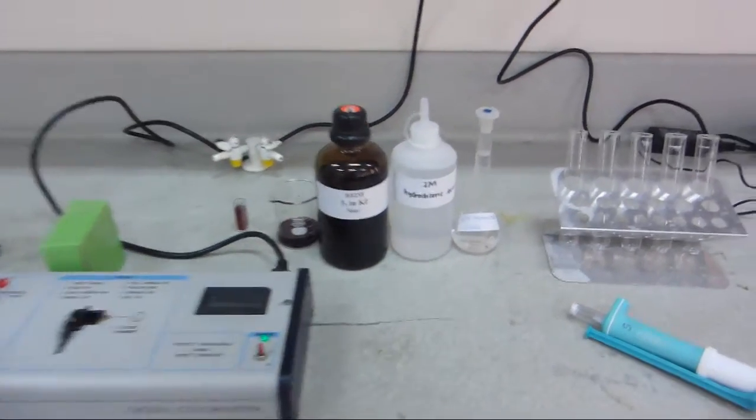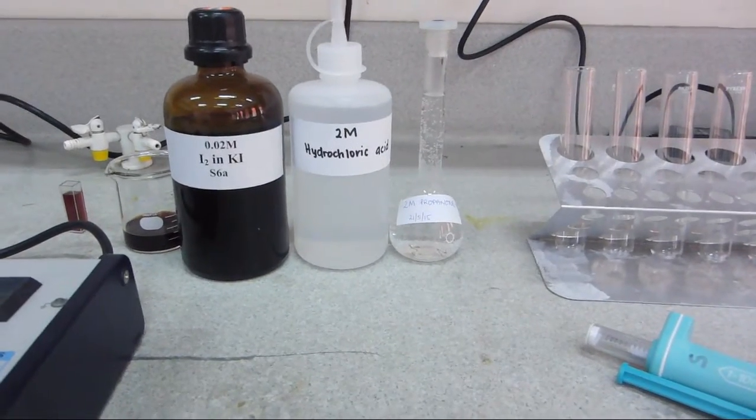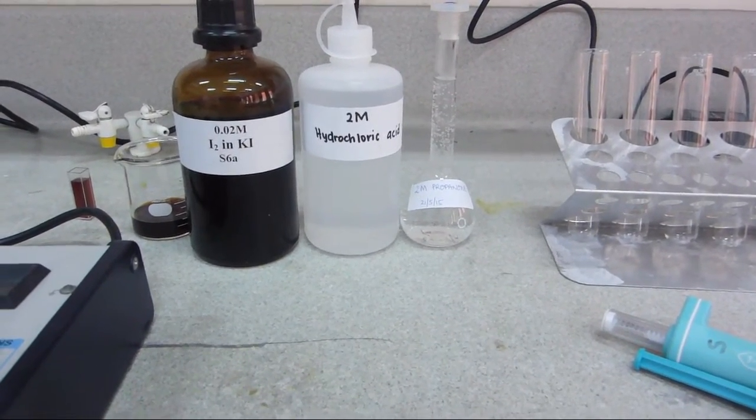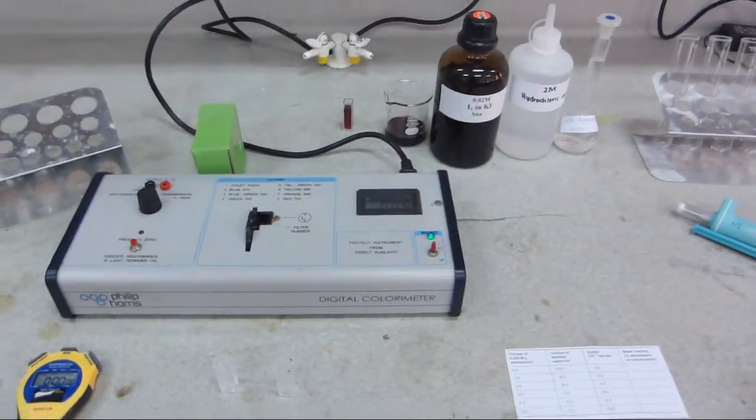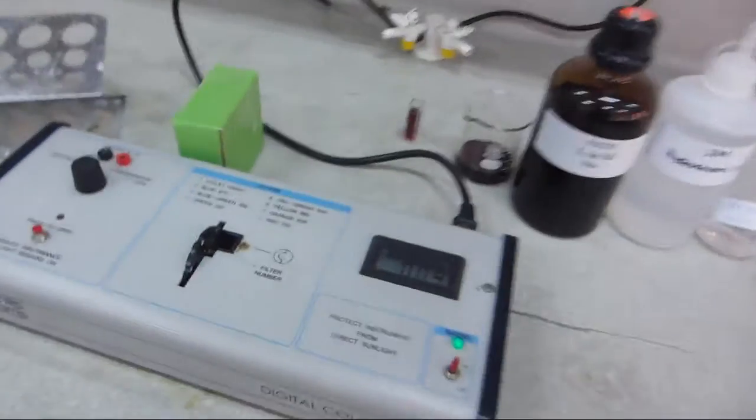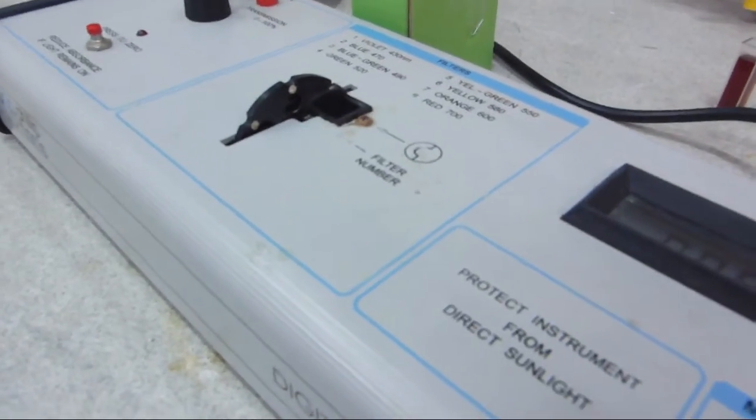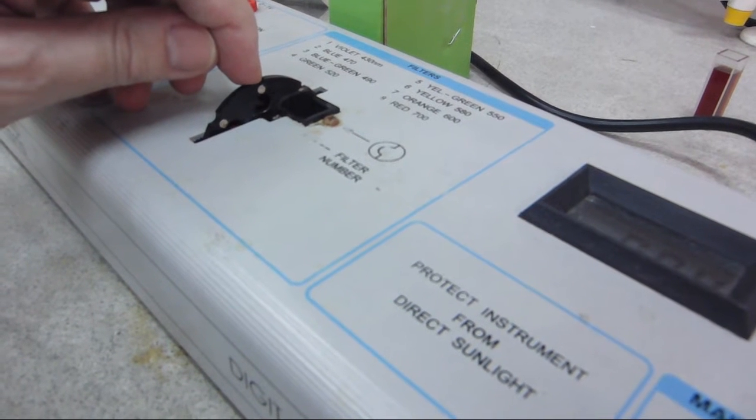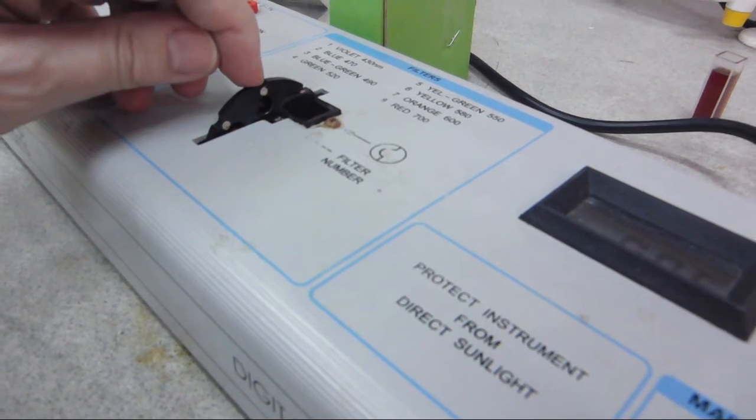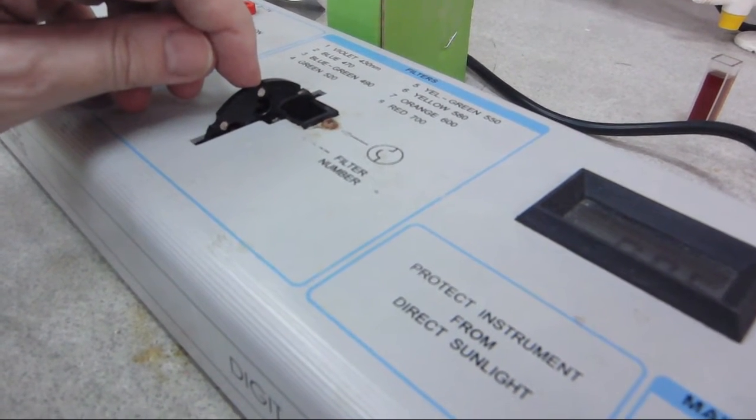In this experiment, we'll be looking at the reaction between iodine, propanone, and hydrochloric acid, and we'll be monitoring the reaction in a colorimeter. You may be able to see that on this colorimeter, we've selected filter number three, the blue-green filter at 490 nanometers, as recommended in our worksheet.